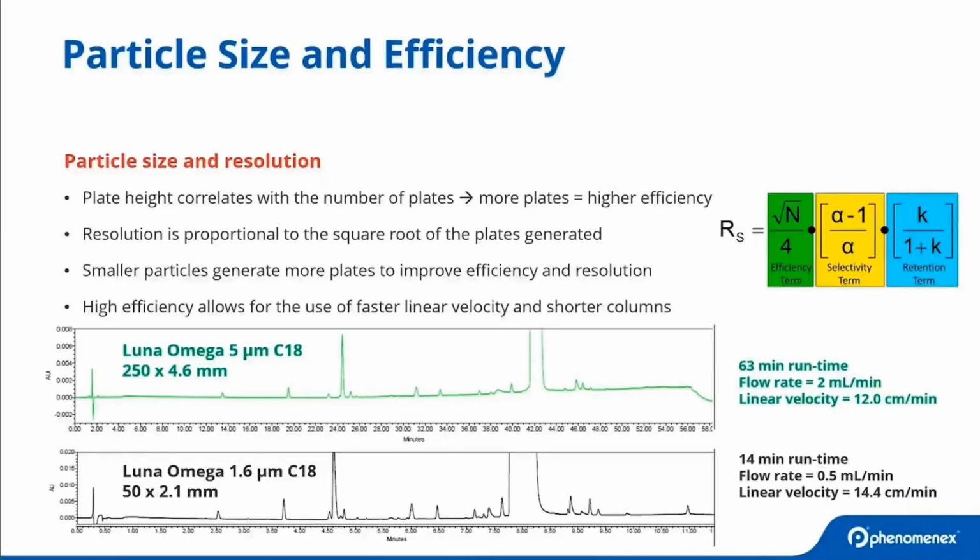So just be mindful, though, that when we speak of resolution, and specifically when we speak of theoretical plates, which are referred to as the N term, there's a certain extent to which improving your theoretical plates will ultimately both improve your resolution and allow for shorter runtimes.